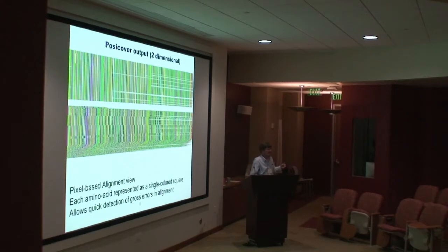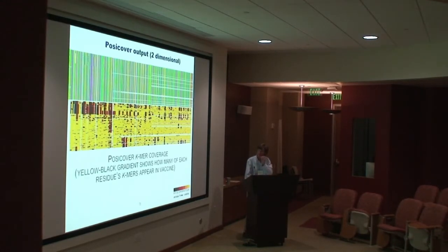Not everyone looks at the data as much as they should, and so sometimes something that you think is aligned isn't. So I find it really handy to generate these sorts of images just from an alignment, where you can see, oh yeah, this is not quite right. The classic error is to submit sequences that you think are aligned when they're not, and garbage in, garbage out.